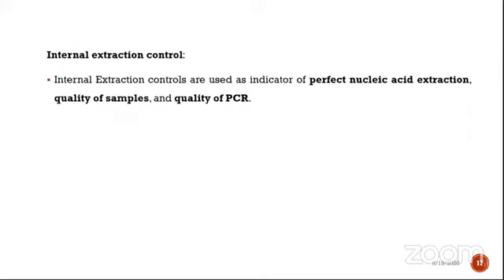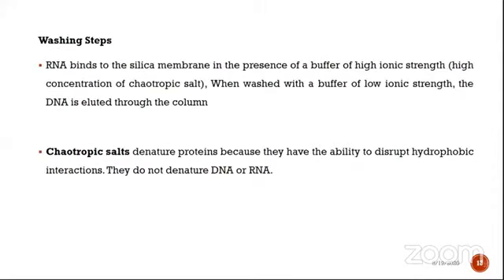We will also add the internal extraction control as an indicator for the quality check of the nucleic acid extraction, the quality of the samples, and the quality of the PCR. During the washing steps, RNA binds to the silica membrane.